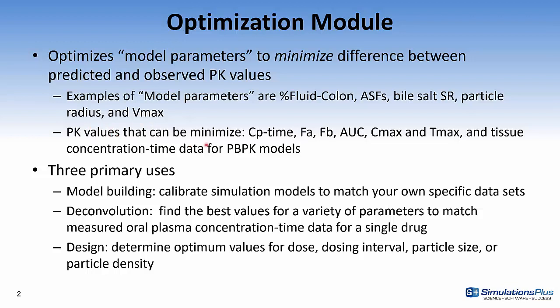PK values that can be minimized include the CP time curve or the fit to the CP time curve, fraction absorbed, oral bioavailability, area under the curve, Cmax and Tmax, and tissue concentration data for PBPK models.